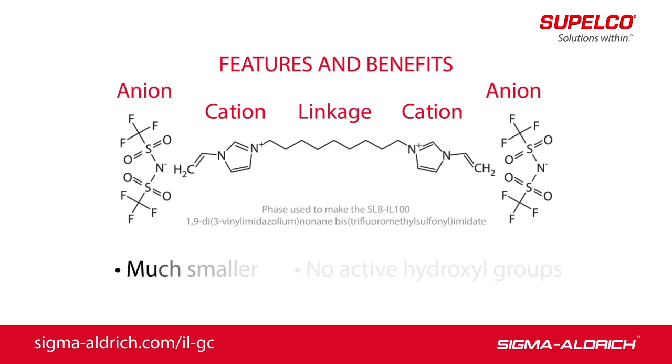They are smaller compared to big, bulky polysiloxane polymer and polyethylene glycol phases. Also, there are no active hydroxyl groups. These features lead to greater stability, even in the presence of moisture and/or oxygen.